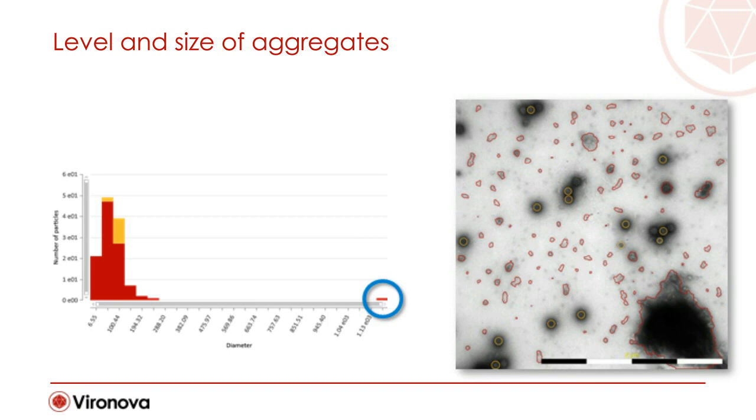Yeah, Martin, as you said, when working with viruses, you normally know the size of the virus that you're working with. So the peak of the virus in the histogram is not that interesting, actually. It just confirms that you have your product. It is actually the other information that does not belong to your virus peak that could be of interest. And there are, of course, many different reasons why the material would form aggregations or aggregates that we went through before.